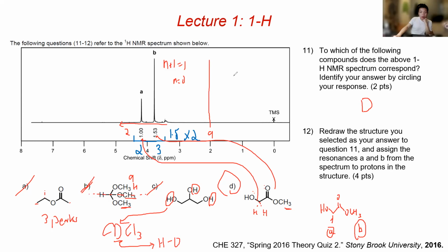So here's the thing about OH and amide. Because of how NMR determines the integration number, whenever you see like a 1.5 or 1.3, you want it to be an integer number.